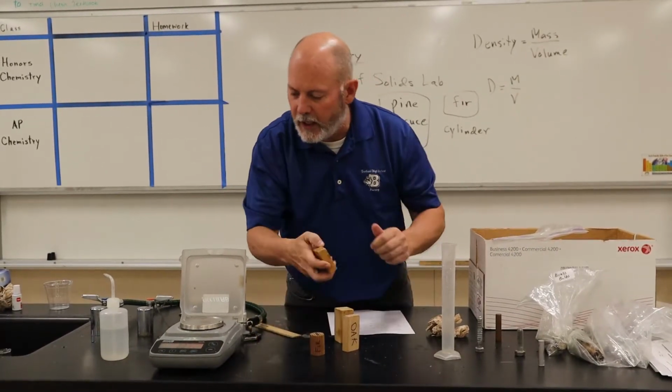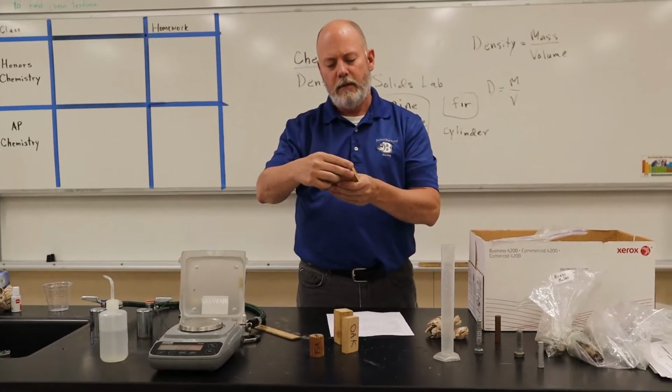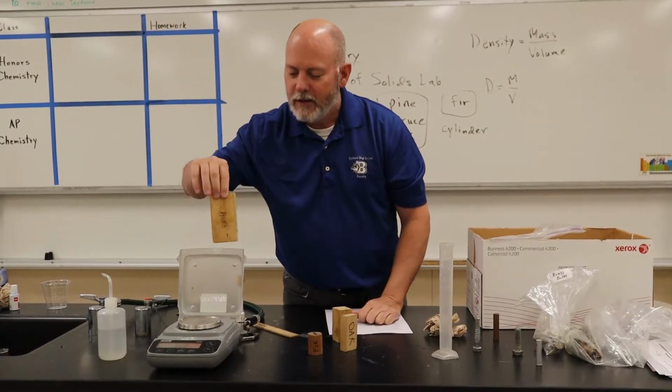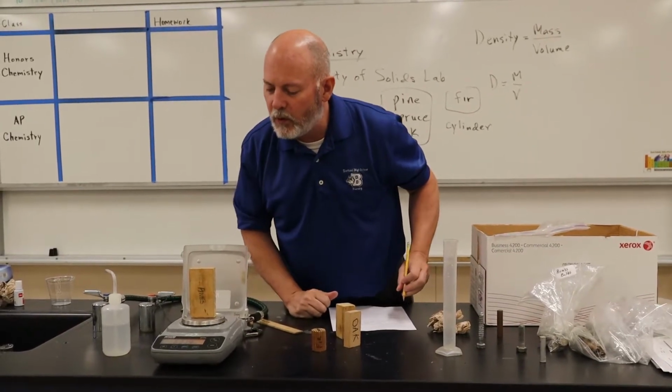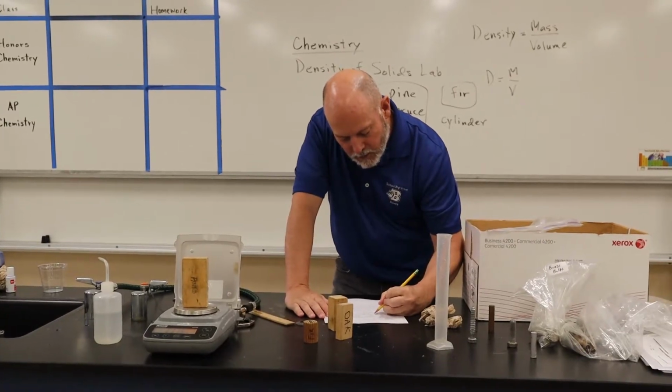And the pine is fine. We'll weigh the pine here, and that's 63.14 grams. Okay, so we got our weights of our woods.